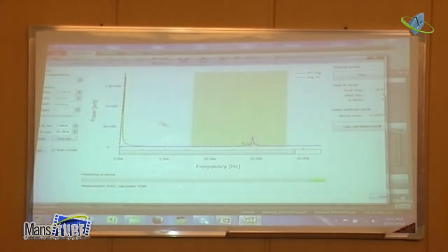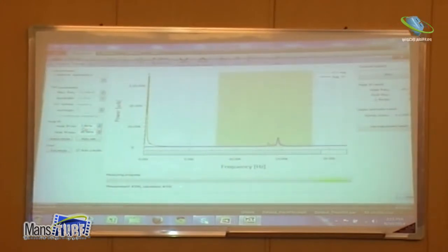I said this is maybe too much, so I can change the range here. The peak fit minimum is 7.8 kilohertz, maybe I can put it at 10. And you see, when I put it at 10, it makes the range smaller. And then here maybe I can put 15, and the other one maybe 12, let's say 16, something like this. Okay, and then it's making a fit along this spectroscopy.